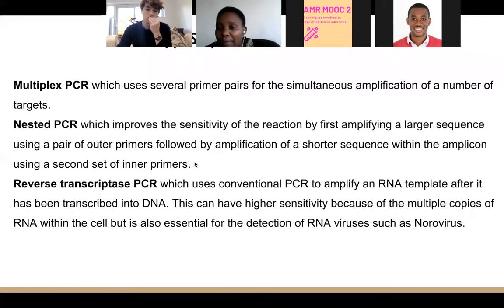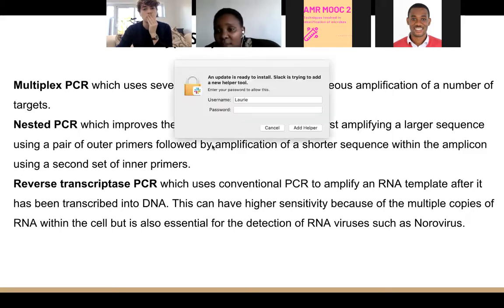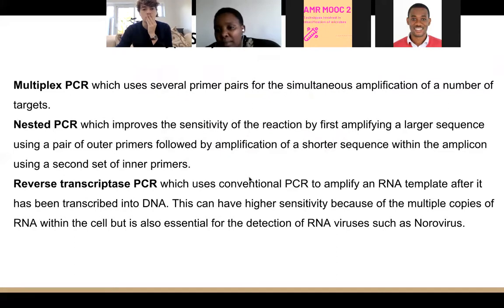For example, if you have a mixture of samples, maybe you have DNAs from viruses, from bacteria, from protozoa, you can use the first round just to amplify DNA from bacteria. It means that at the end of the PCR reaction, the sample will have too much bacterial DNA because those are the ones which have been amplified. Then from there, you can use primers which are specific to a certain strain of bacteria. So in the first round, you have reduced and omitted the DNAs from the viruses and others, remaining with a high number of DNA from bacteria. Now you can go further and use a specific primer to amplify a specific strain of bacteria from your pool of DNA. So that is the next step.